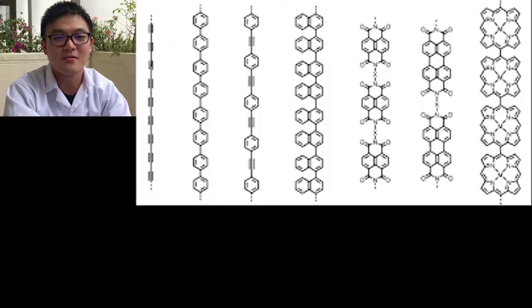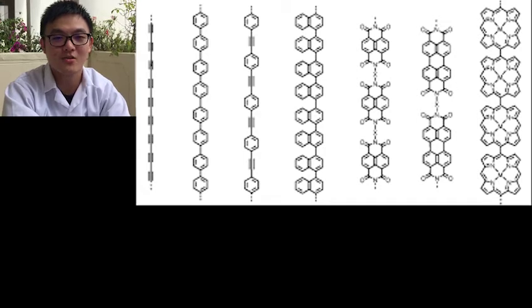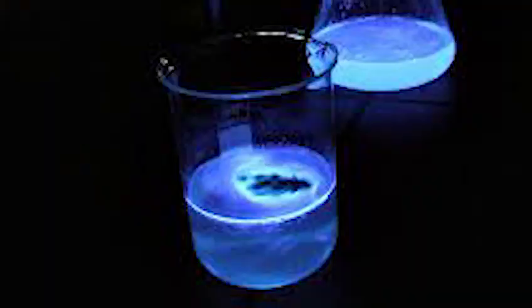Besides, the structure of the analyzed molecule must be rigid. If it is not rigid, the floppiness of the molecule will allow more vibrational interaction and internal conversion rate, which will decrease the fluorescence activity. However, some of the chelating agents will only fluoresce when they are bound to a central metal atom. For the determination by fluorescence photometer, the analyte must be a luminescent substance.